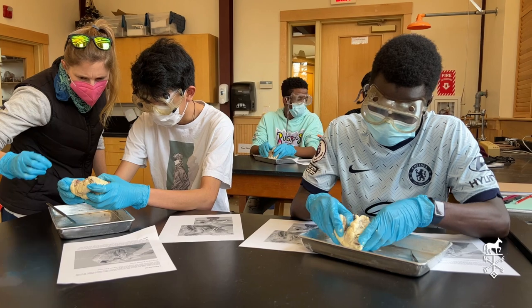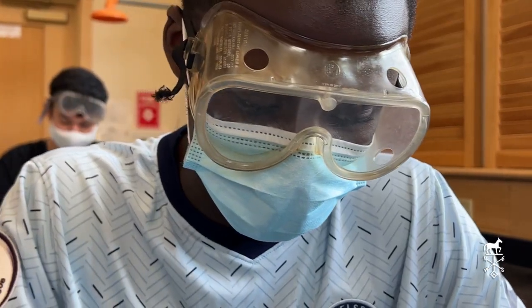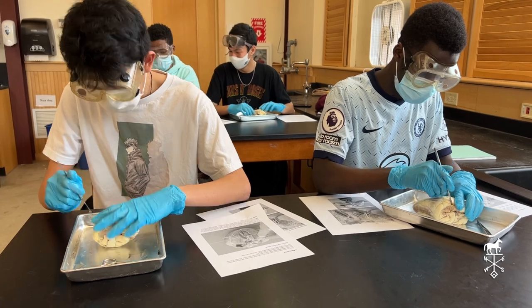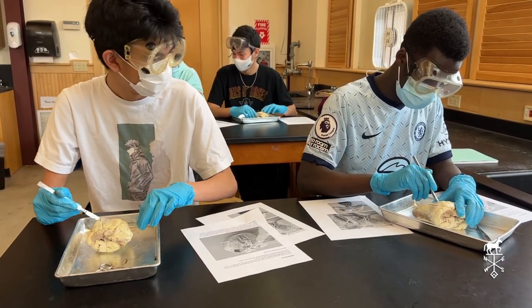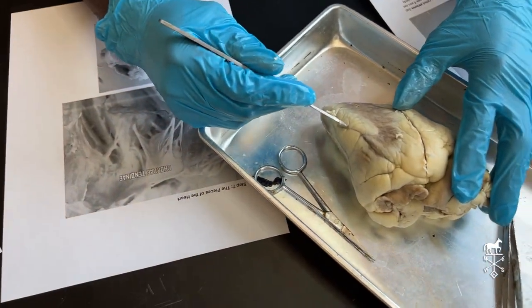My name is Zebulun Biaruhanga and I'm in grade 10. We are currently doing the heart and today we dissected our heart and we got to see the different valves and different parts of the heart.